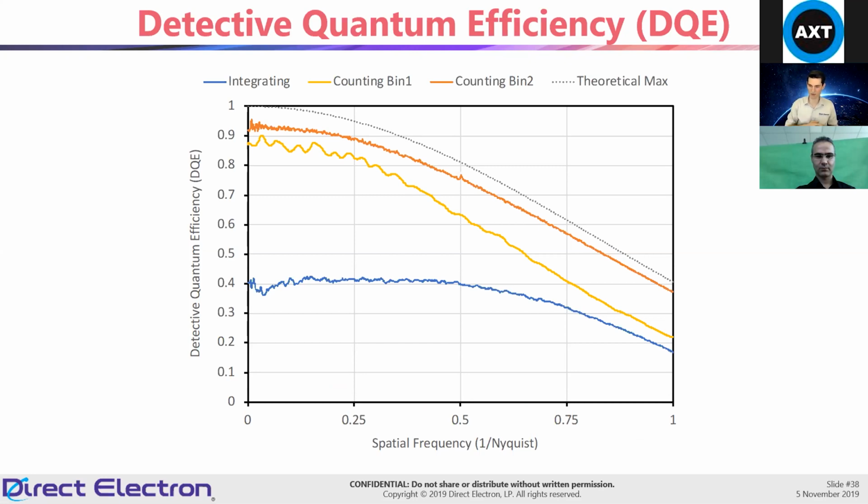So this is actually our DQE curve. The folks at Florida State from Scott Stagg's lab have actually done another DQE curve with their own DE64 and found it to be essentially identical to ours.